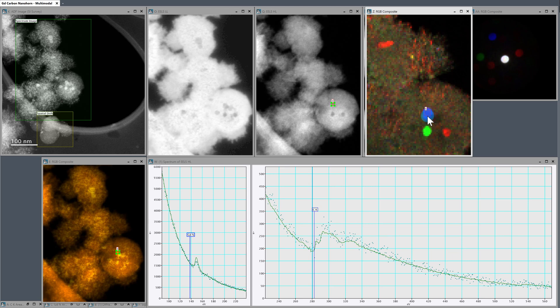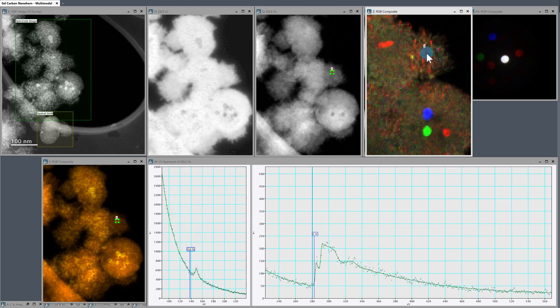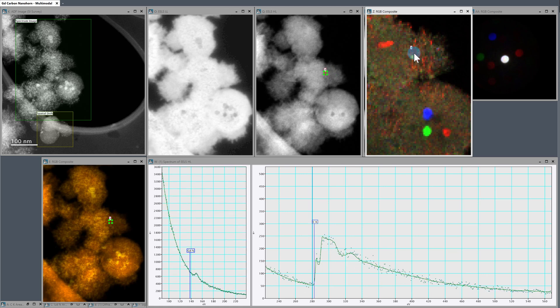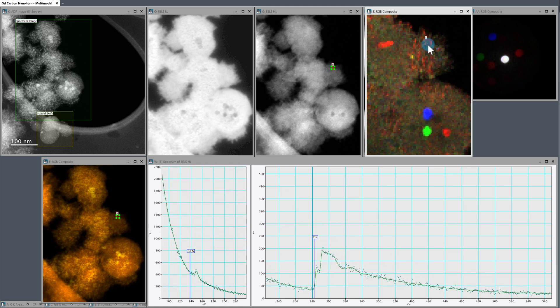So we kind of have really nice linkage here between our diffraction data, our EELS data, our denoised data, all in a single experiment. And you can do everything with digital micrograph. So I'll leave it there for now. And see you all next time.